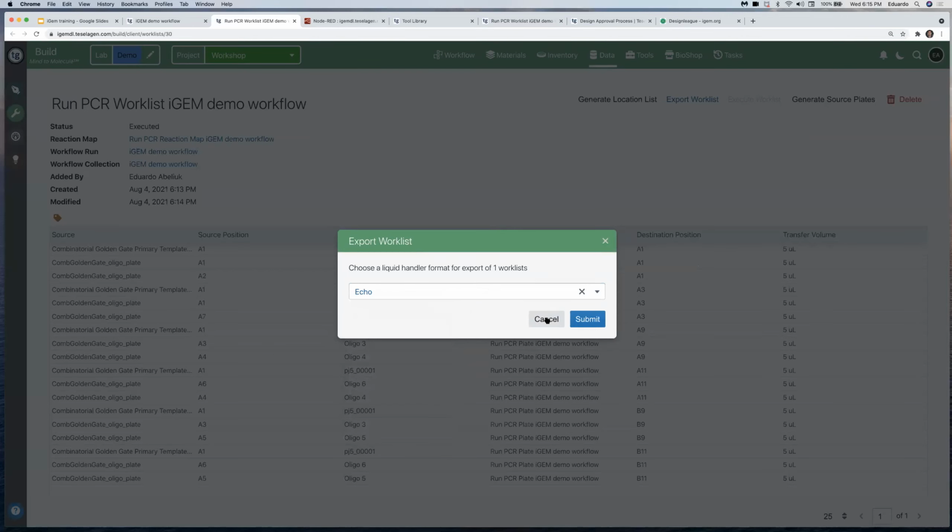And then the robots will do the work for you. This is how it works in any company. Most companies, from small to larger companies, are using automation equipment that automate all these reactions for you.